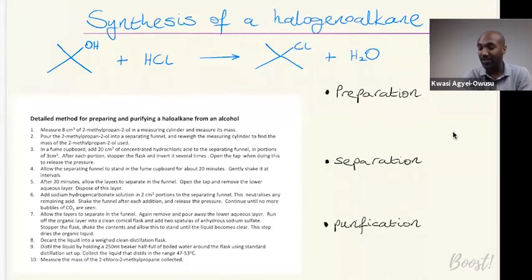So in this reaction, we've got to make some 2-chloro-2-methylpropane, which I will highlight here, and I'll highlight that in blue. Okay, so we can also name it as a bit of practice. Let's call that 2-chloro-2-methylpropane.